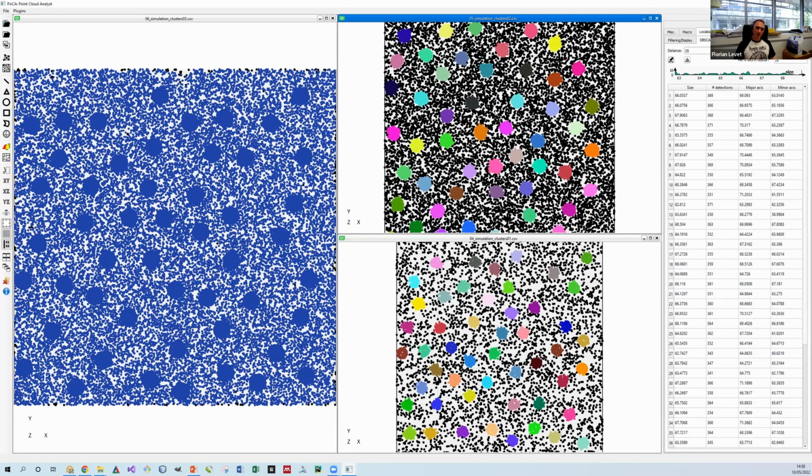So you have two parameters, and you need to change them every time that there is a different density. So when you have your biological study, there is a lot of odds that the density will be different. So you will need to go check every one of your data to see if it's working or not. So it's a big problem, I think, with this technique, even if it's used a lot and it's working, but this problem of density is really annoying.